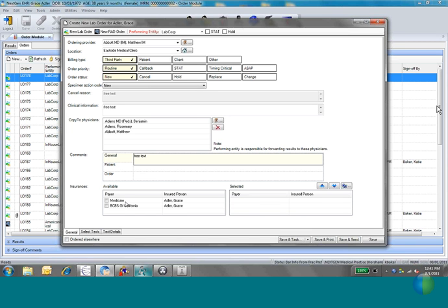And then here's where you can choose the payer. This particular piece, if the encounter has already had the payer assigned, you don't have to do anything here. I created this encounter in EHR, so I didn't assign any insurances. But if they had, meaning they had chosen Blue Cross of California for today's visit, it would show under the selected side, and you'd have a checkbox to have that information listed.